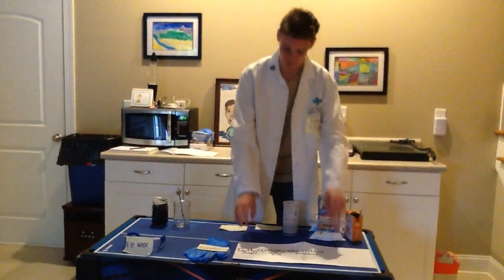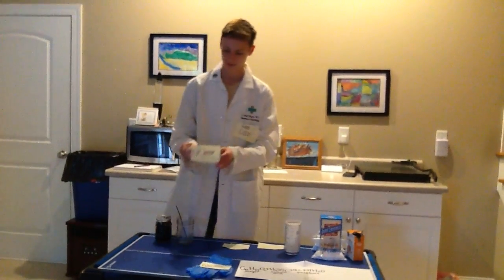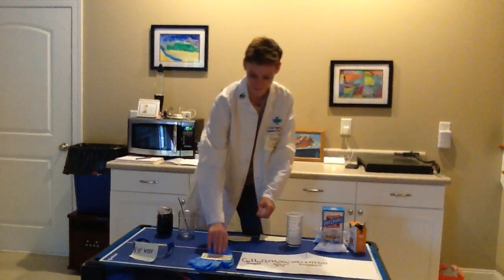To do this experiment, you first have to have the proper lab safety gear, which includes a lab coat, eyewear, and some gloves.